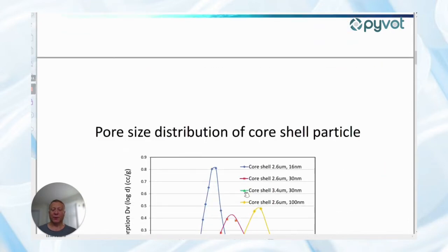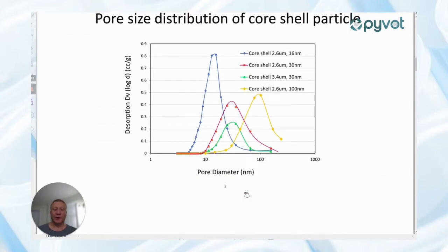And for those interested, the pore size distribution of the core shell particle is noted here. And again, we're using nanometers to show this.